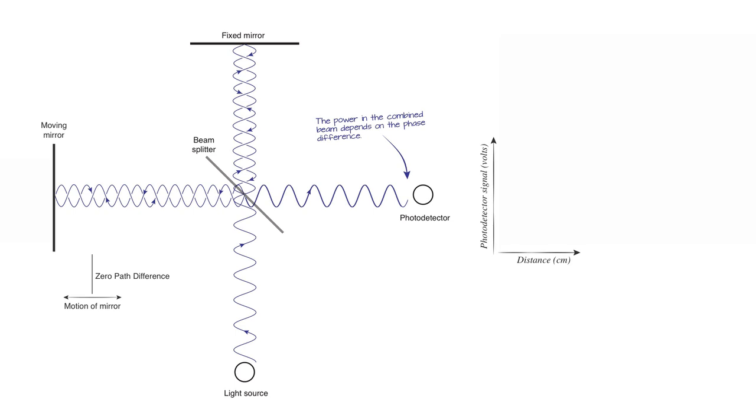Now, this is what an FTIR experiment would be. We start the mirror at one location because we don't really know where zero path difference is. I mean, come on. To actually fix two mirrors exactly 1 billion wavelengths apart from each other, and exactly there, not one being 1 billion and one being 1 billion and one, both being 1 billion wavelengths apart from each other. How can that happen?